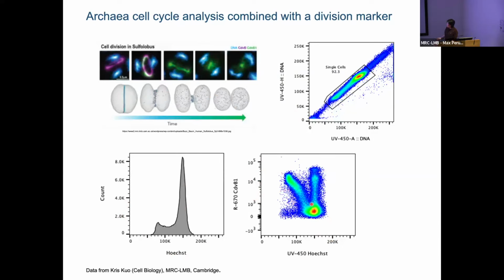Another thing I want to mention is when you analyze the cell cycle: for immunofluorescence, like most fluorophores, you should plot them on a log scale. But for the cell cycle, you want to plot it on a linear scale.